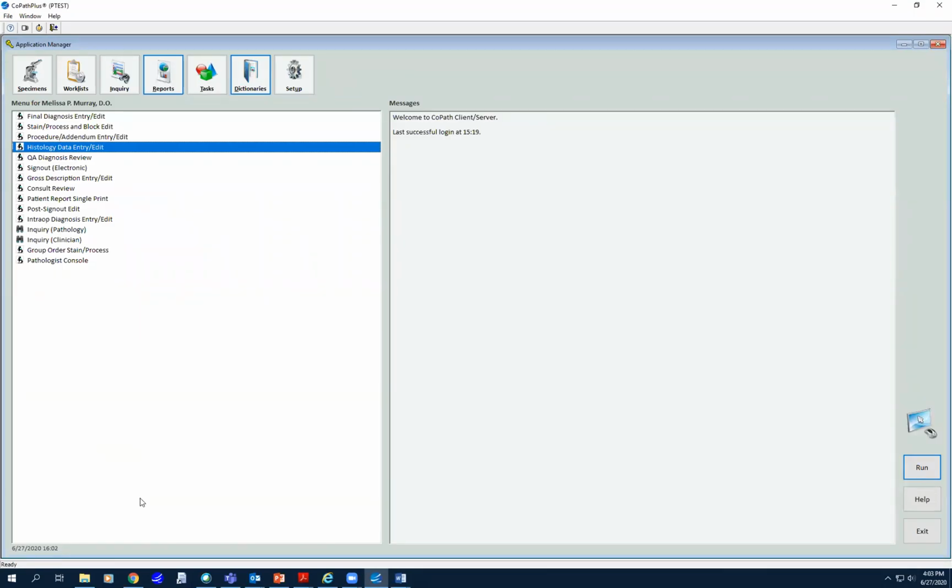Okay, this is going on a little bit long, so I'm going to stop right here, think about other things maybe I should make a recording for. This information is important. It's a lot of information we're going to be giving everybody for orientation, but also on some level, not quite enough. We will be here and around and helping you get through the system in the first few weeks. So don't stress about it, but you can look at this again and you'll have access to this when you arrive in the department. Okay, thank you.